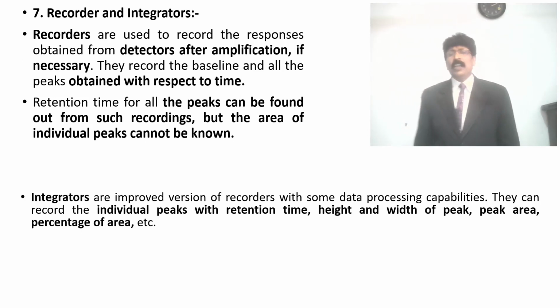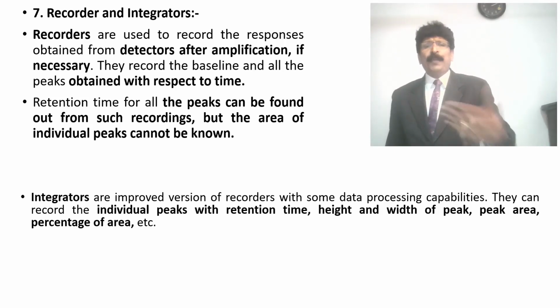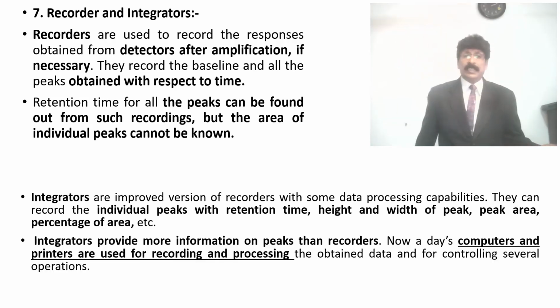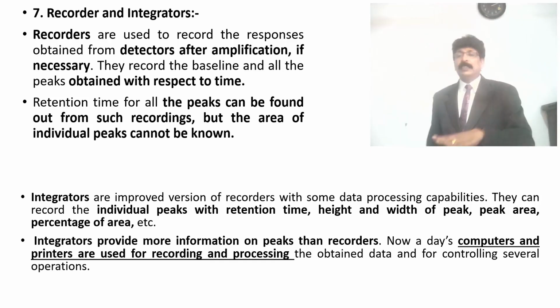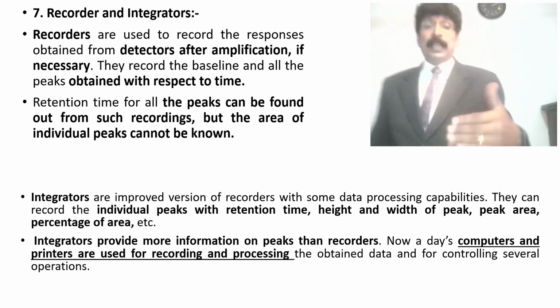They have some data processing capabilities. They can record individual peaks and retention time, height, width, peak length, number of peaks, peak area, percentage area, etc., which can be easily integrated. Integrators provide more than recorders. Nowadays computers will give you all the parameters. Printers can also be connected and you can easily get the data.